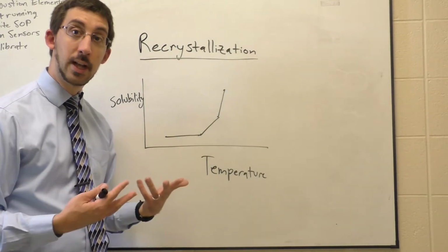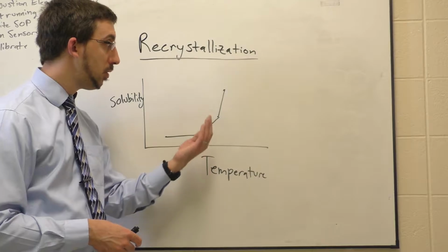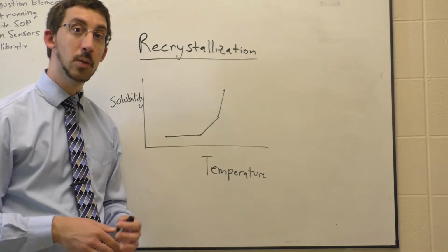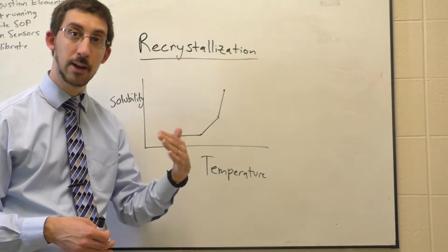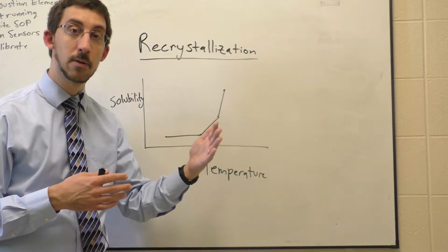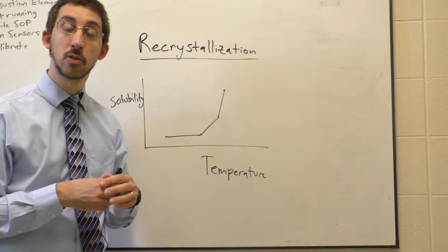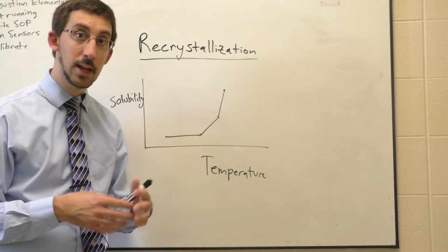It will crystallize out of the solution. And if we do this cooling process slowly, then it will have adequate time to come out of solution in an ordered fashion, providing a nice crystal lattice structure that replicates upon itself. And this tends to prevent any impurities from being trapped within those crystal structures.